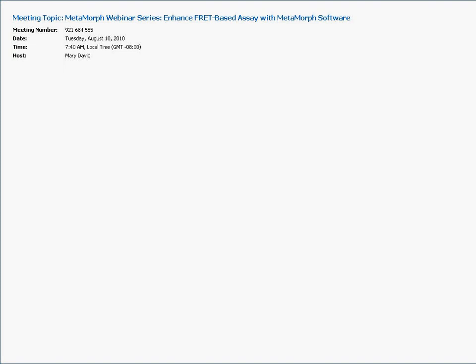So a scale bar within intensity can be done under the Display menu, Graphics. Actually, you would draw a gray wedge on the image for that. You would specify the range between those. So that's how you would set up the intensity scale bar within the image.